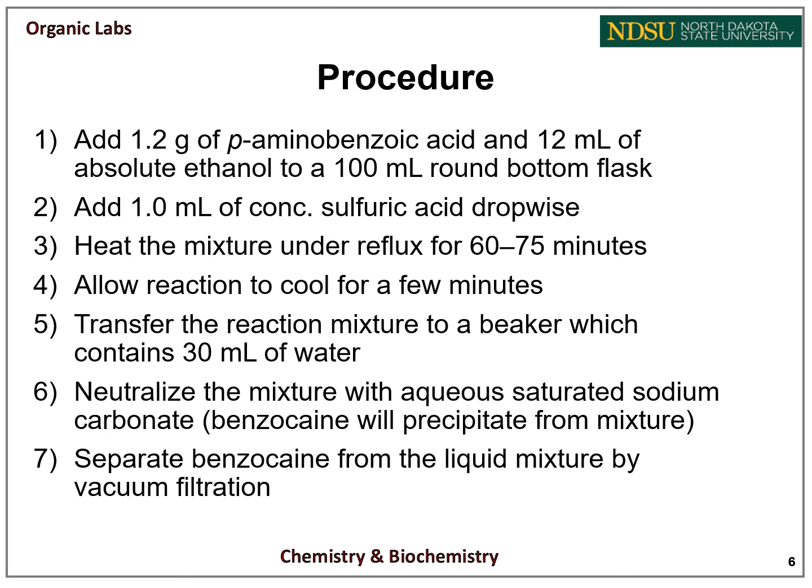Allow the reaction to cool for a few minutes, then transfer the reaction mixture to a beaker which contains 30 milliliters of water. Neutralize the mixture with aqueous saturated sodium carbonate. This will cause benzocaine to precipitate from the mixture. Separate the benzocaine from the liquid mixture by vacuum filtration.